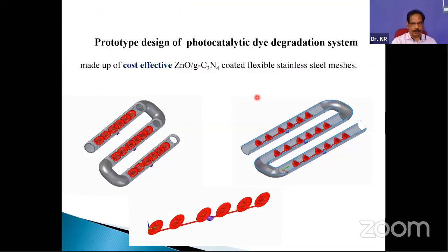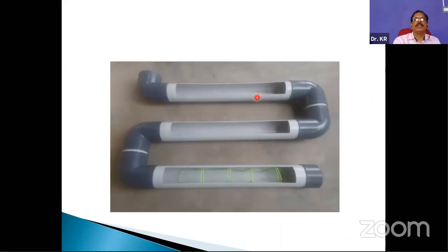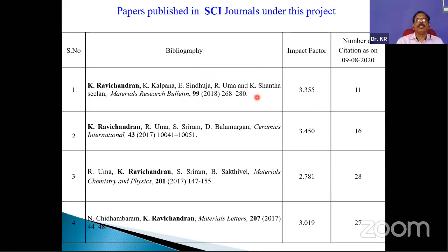This is the prototype of the photocatalytic dye degradation system designed and developed in our laboratory for this project. And we are trying for getting a patent. These are the papers published under this project.